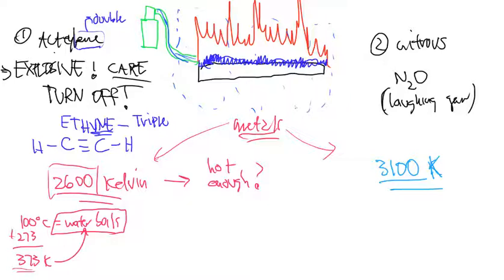And again, the reason is because temperature is very important. You can't measure a metal if it's not going to freely go into the flame to get measured. And the hotter flame will allow some of the stubborn metals to be detected and analyzed in the instrument. All right, so that's the story with two different burner heads. You got to make sure that they match the proper gas that you're using in the analysis.